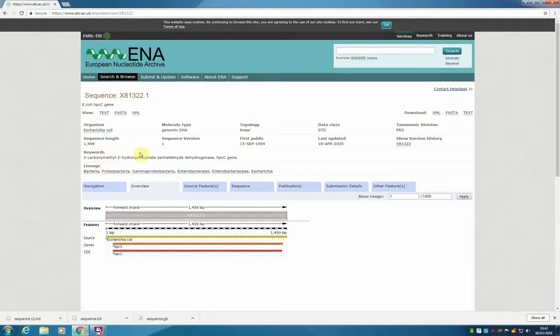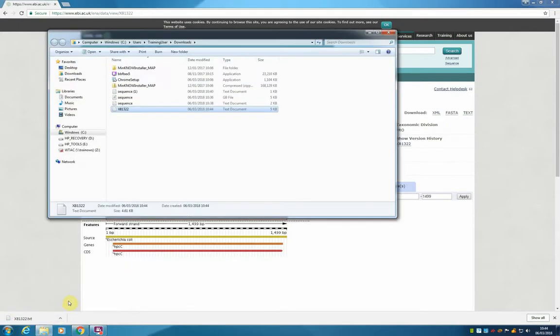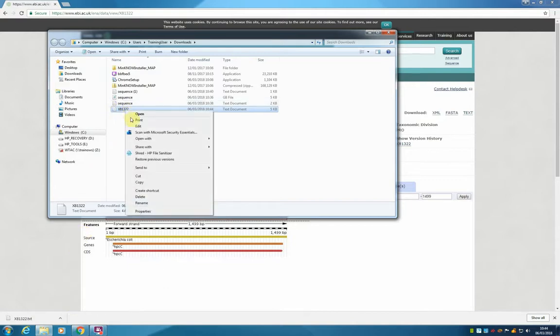We are going to click text. This will automatically download a file for us. And from here we can find it in the finder. And this is our file. And we can open it with WordPad.